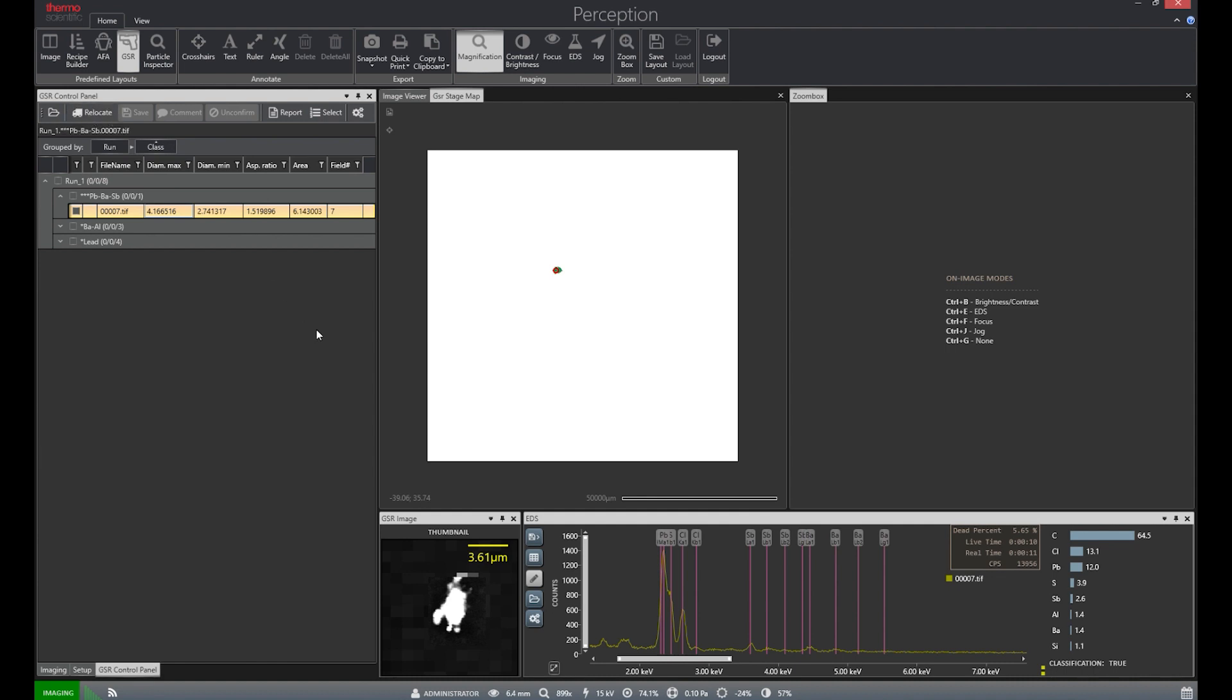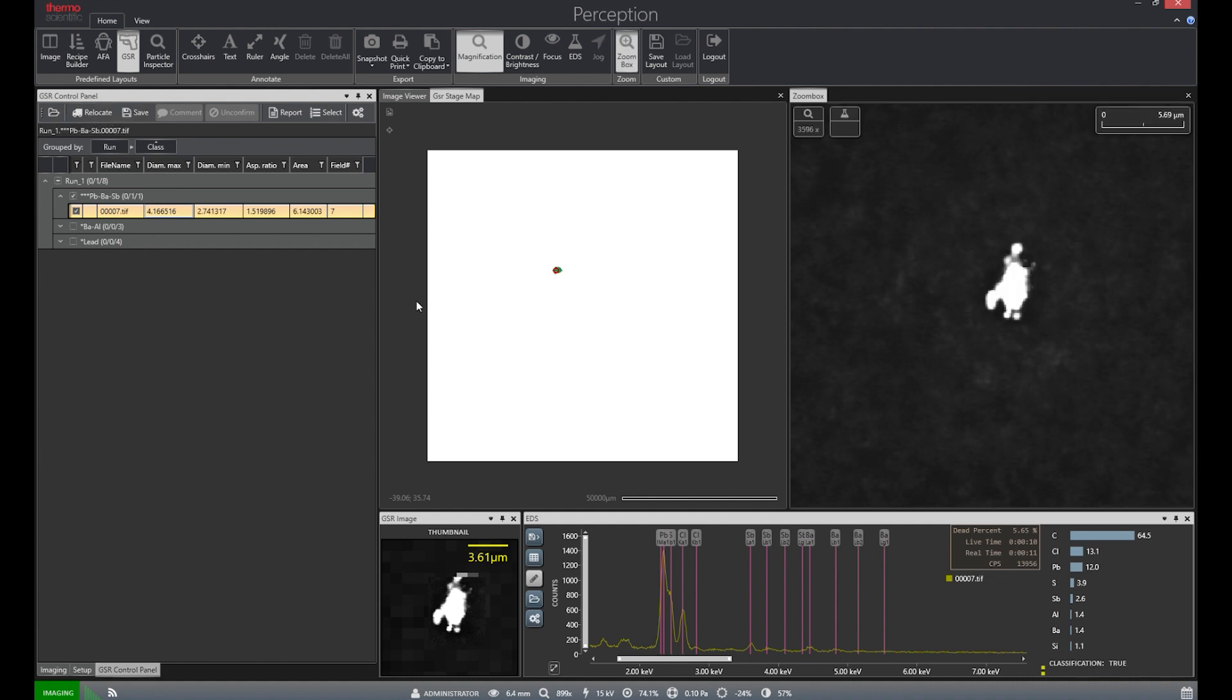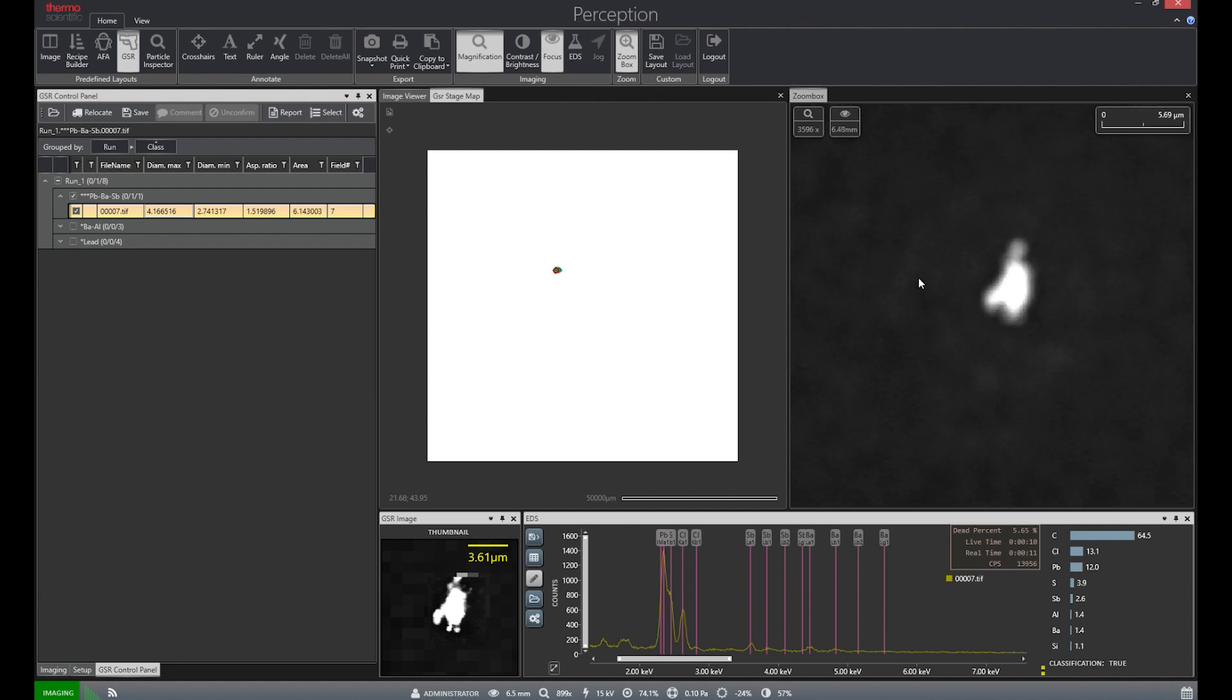Select the first particle and then hit relocate to move the stage to its location. We are then able to adjust the focus of our SEM to more accurately view the particle in question.